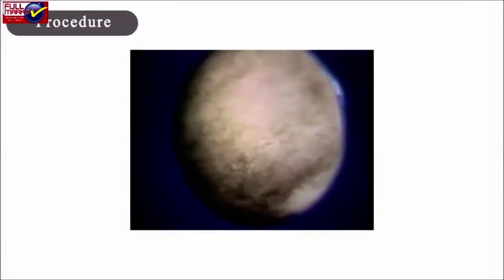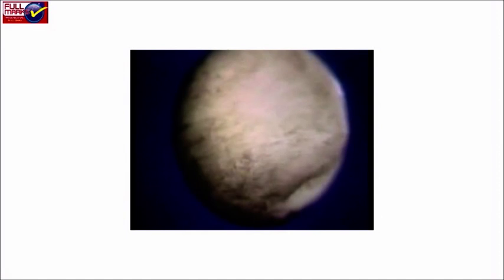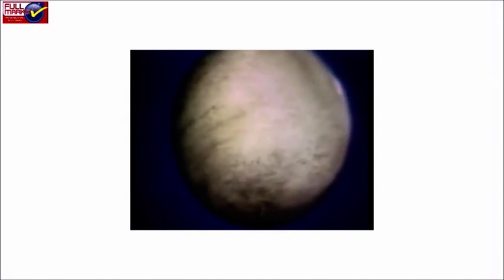Procedure: The zygote undergoes a few cycles of mitotic division to form a solid ball of cells called morula. The cell continues to divide and at the later stages a cavity is formed within it. This stage is called blastula.